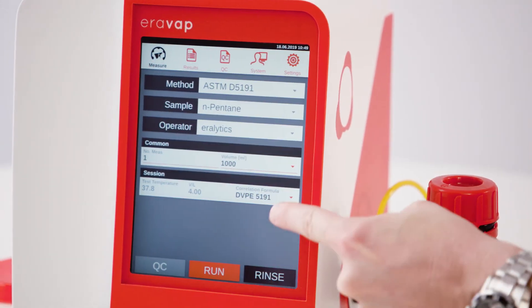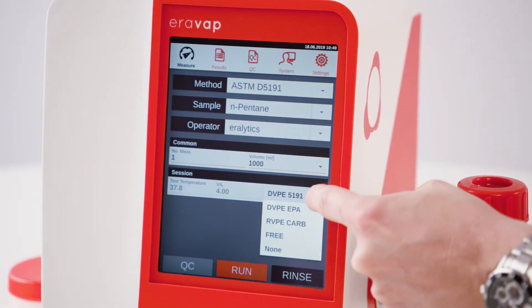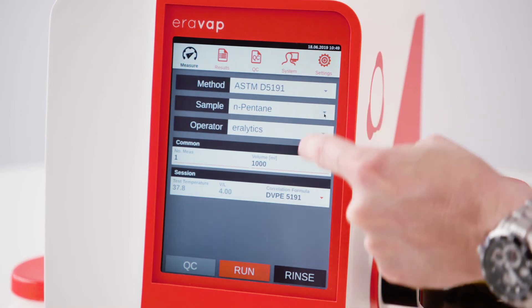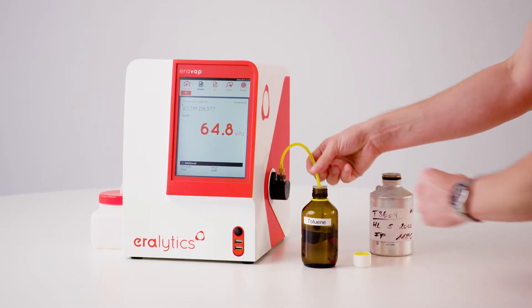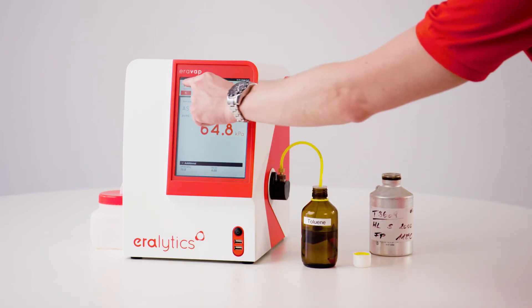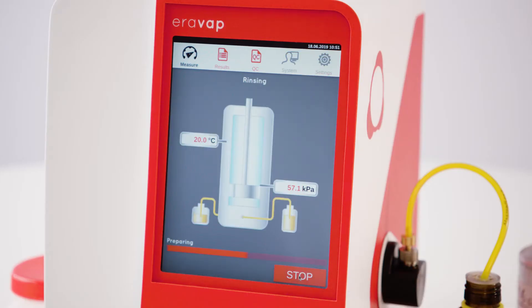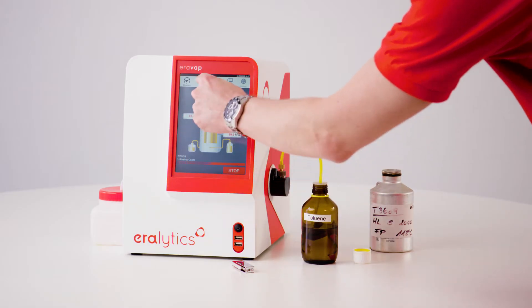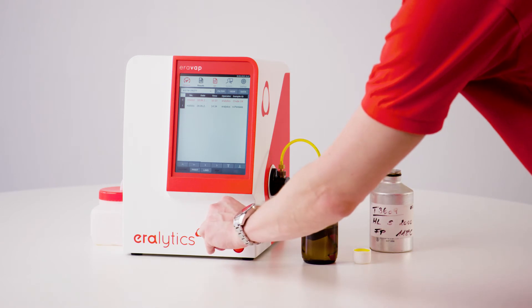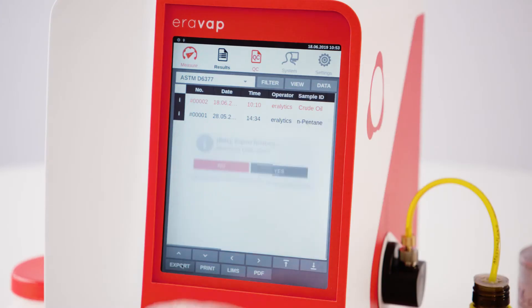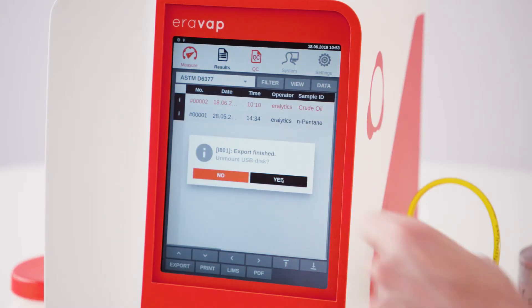AeroVap features the most common ASTM correlation formulas. For gasoline or jet fuel, no follow-up is required and the instrument is immediately ready for the next measurement. For viscous samples like crude oil, additional rinsing with a suitable solvent is recommended. The results are stored in the internal memory and can be conveniently exported to a USB drive, printed, and transferred to a LIMS.